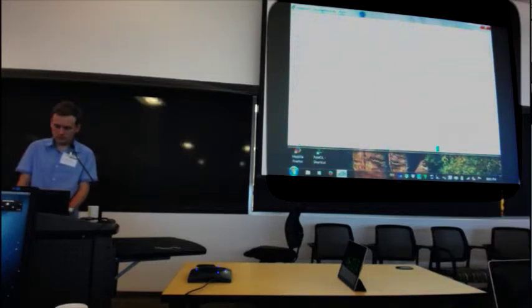If you take one of them and copy it to the other disk drive, the operating system is smart enough that it's one after the other. This is okay. This takes time. If you override this behavior and take one, copy it there, and before it is finished, take the other one, copy it there, it gets bad. If you take this back and copy it there, it gets worse.